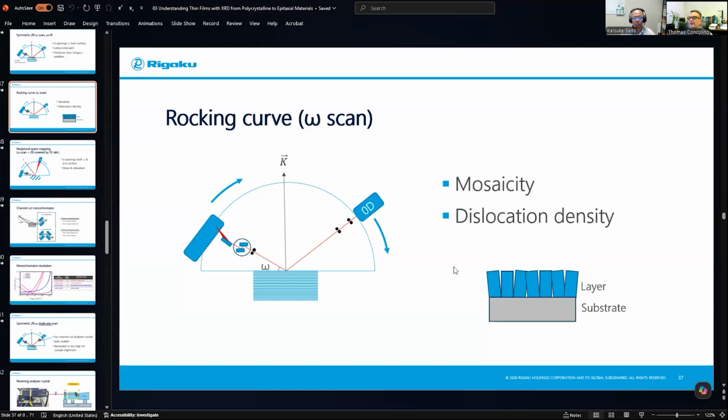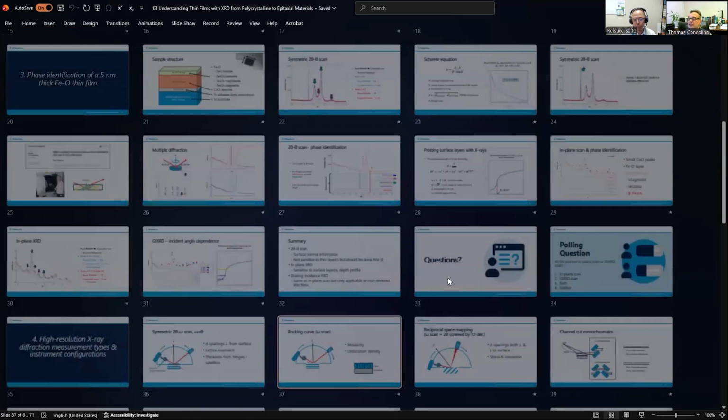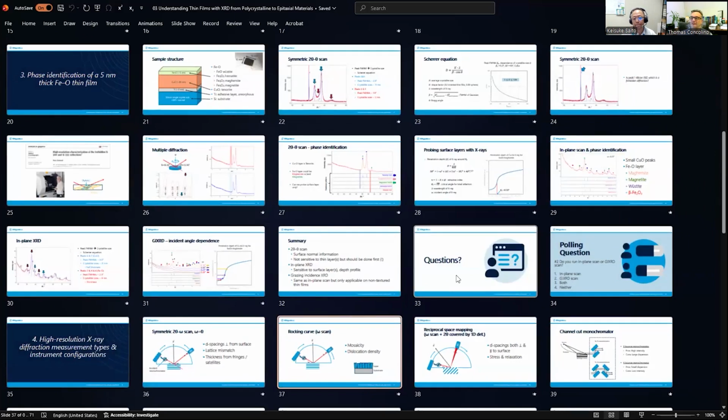Okay, all right. All right, so we're going to do one more here, and hopefully this one we can get done too. Is grazing incidence or rotating better for measuring the thickness of an oxide on a rolled foil? So it's polycrystalline but has directional dependence, right? So it's an oriented film, right? So it has an orientation distribution function, I assume, due to the rolling direction.